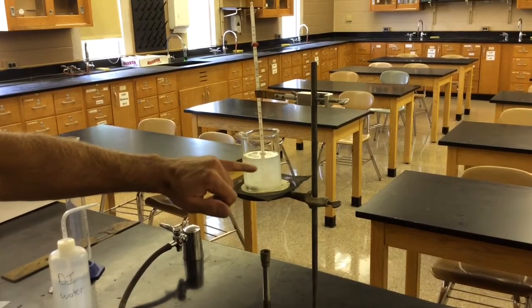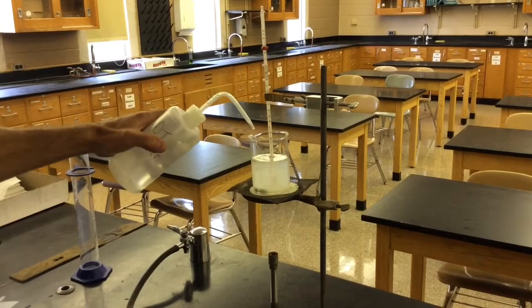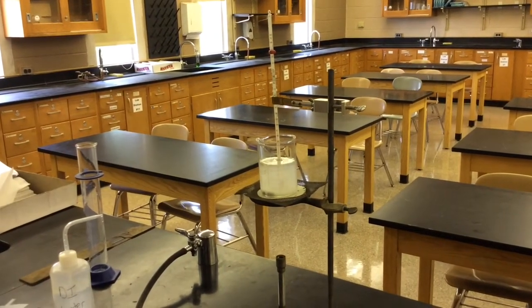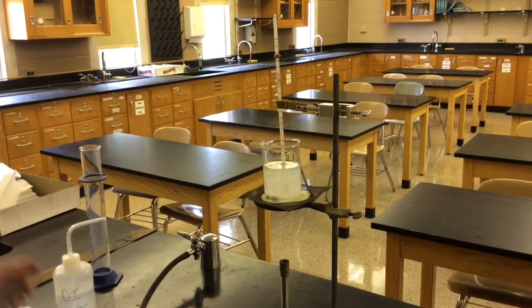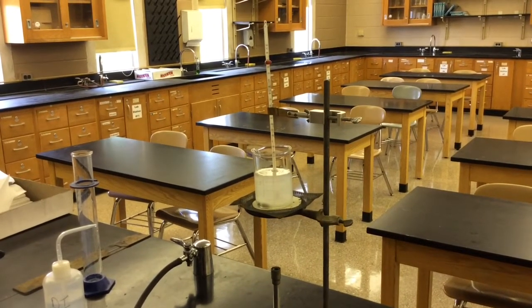Now you saw what happened is when I added that salt in, the level of the water went up. So really what I should have done is add the water first, then dump the salt in, start it heating again. It will boil much faster this time because you started out with water that was already very close to boiling. You do the same thing. Once it starts boiling, write down the temperature every minute for 5 minutes.